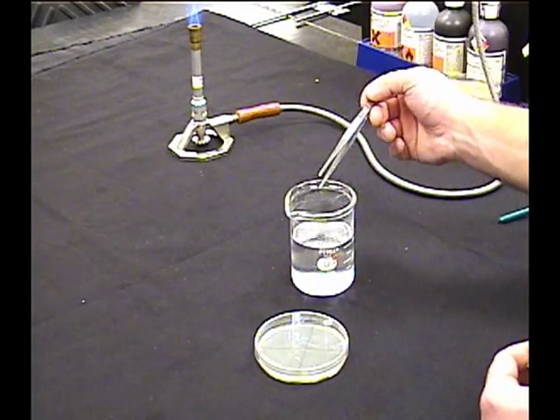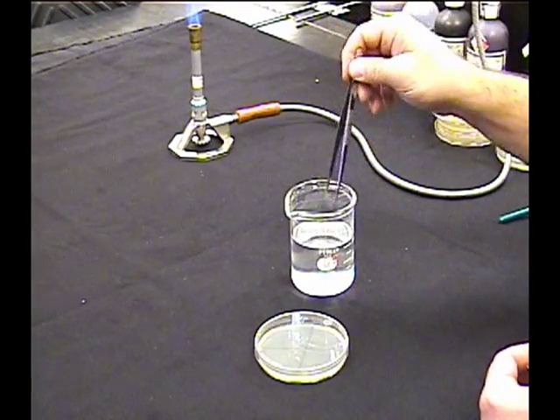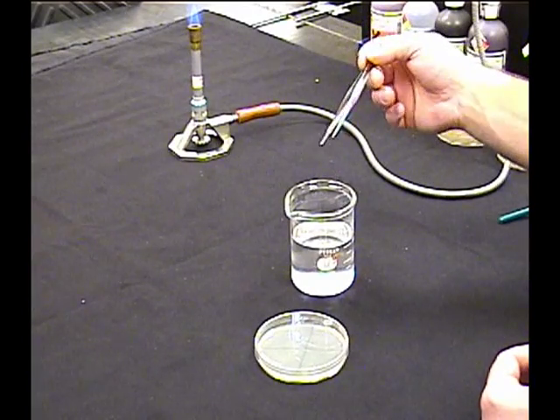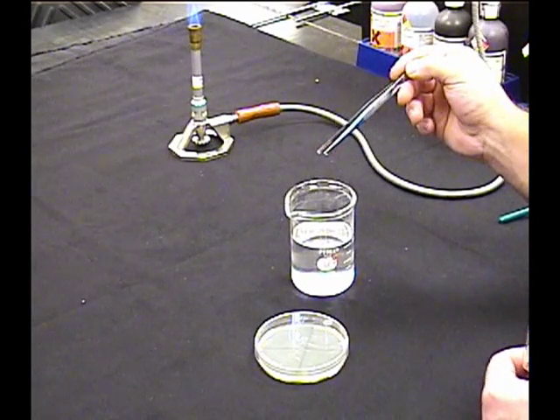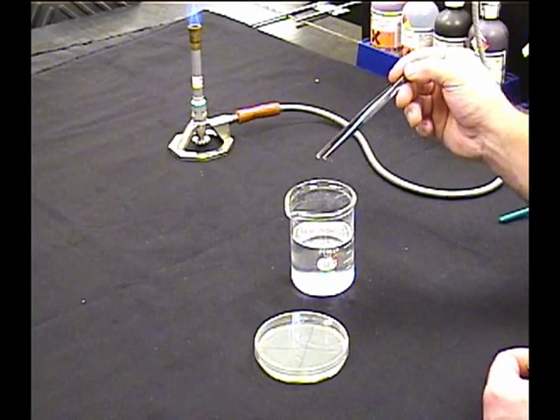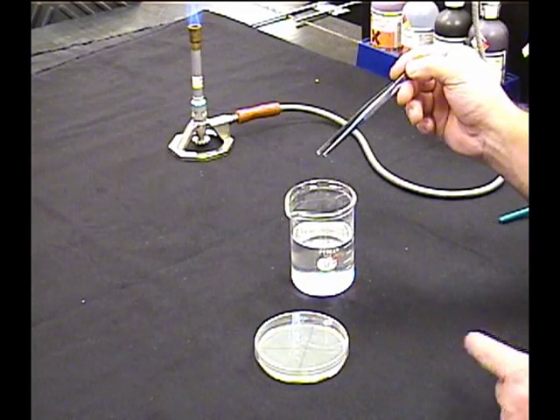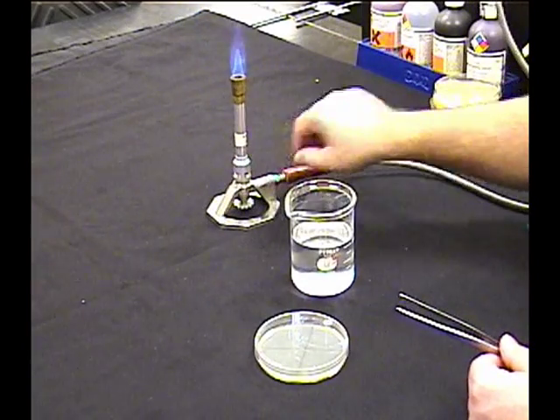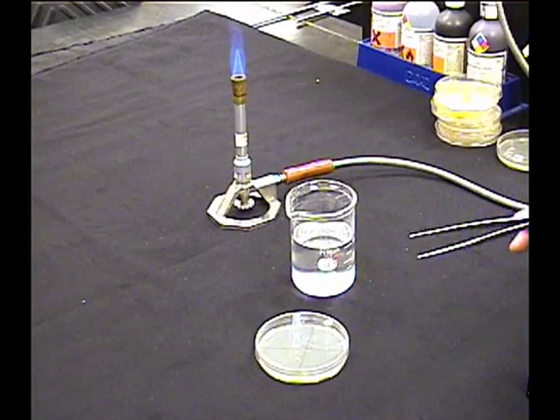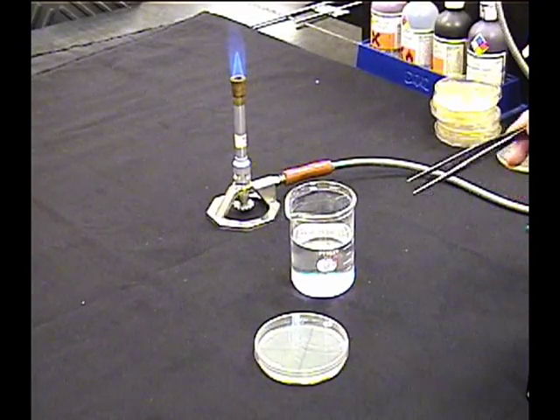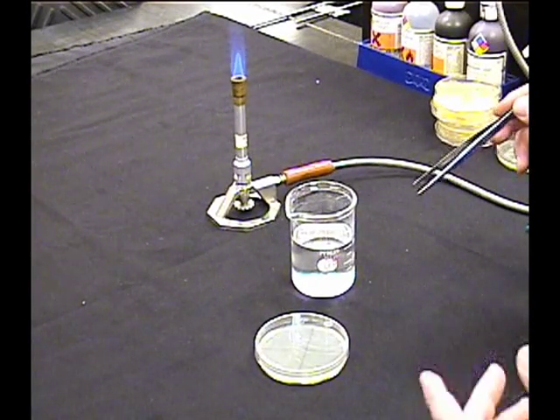But it does a pretty good job of sterilizing for the most part the forceps. But if we pull these out we have a problem because now they're covered with ethanol. We've got to get the ethanol off. How are we going to do that? Well we can let it dry, just let it air dry, but we'd be here forever. So there's a quicker way. Fire. Now you remember I told you that we're not going to flame it, but ethanol burns so we can just burn it off. We can ignite it.